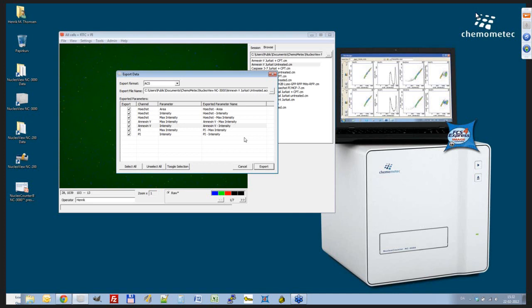I can see there are some questions about how to upgrade our software. The software is really easy to upgrade. If you want to upgrade this software, you simply take our new software and upgrade to this version by reinstallation. And the reinstallation will find out if you have the software already installed. If you have it already installed, then it will choose to upgrade. If you do not have it installed, our installation procedure will tell you how to install the software.